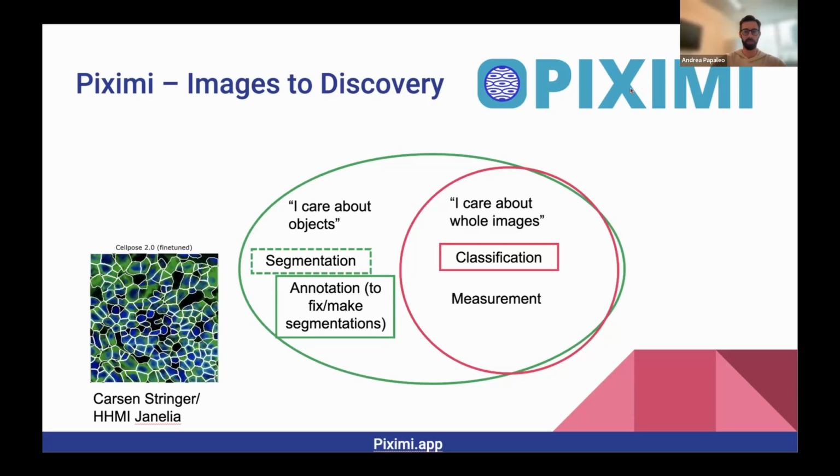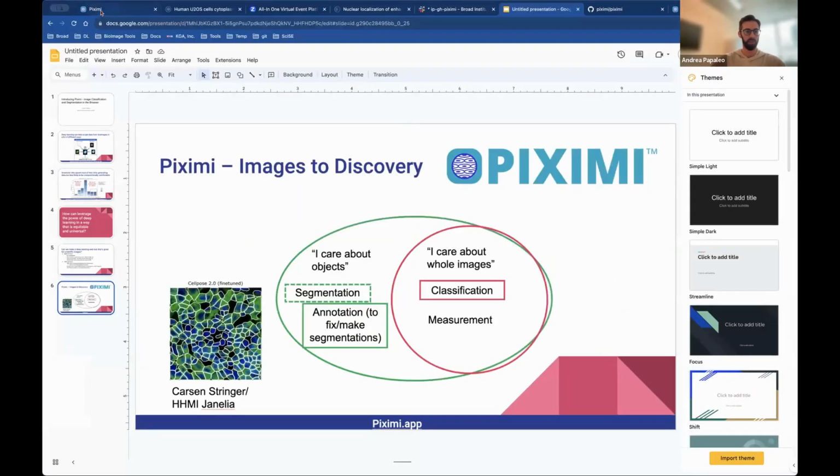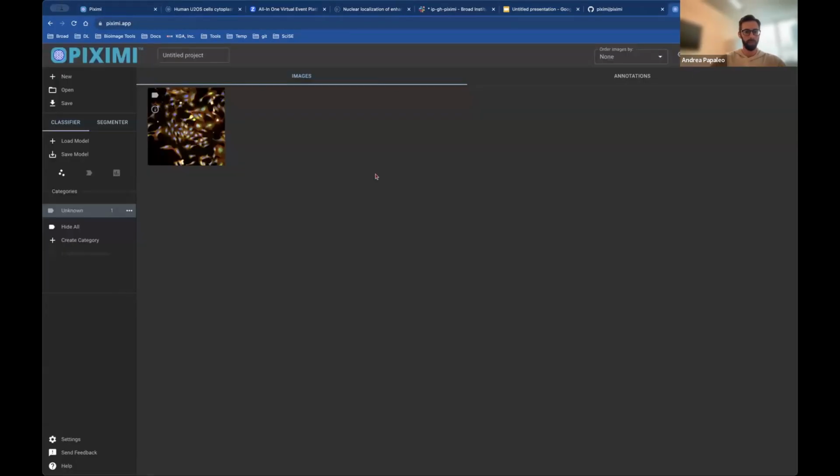So I can just save the slides, just kind of go ahead and show Piximi in the browser. So can everybody still see the screen? Yes, we can. Okay, great.